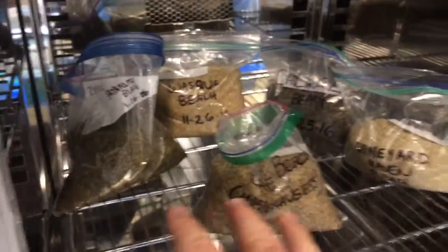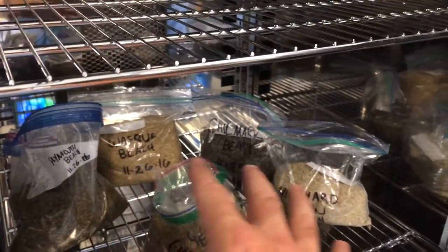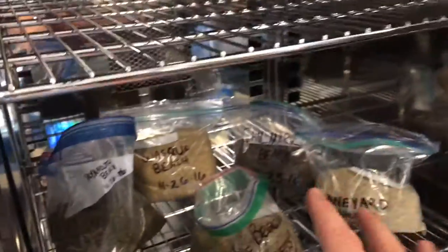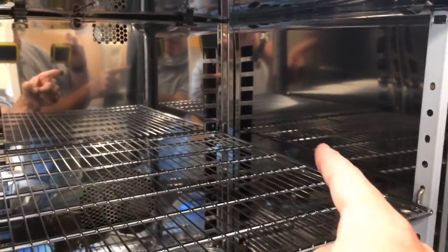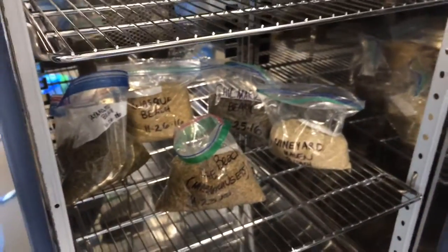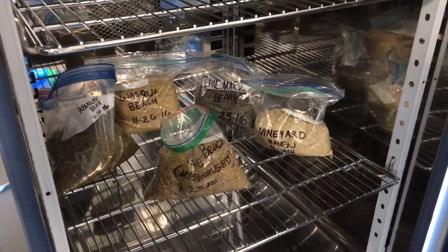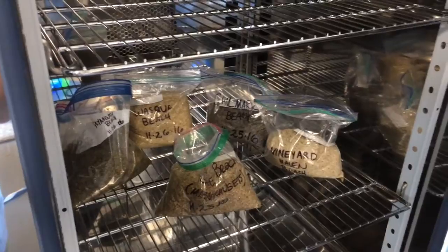So if we have this thing super jam-packed, especially with plastic or metal containers — things that are impervious — we'll tend to get super hot down here in the bottom of the drying oven, and not very hot over here. That will tend to make the sensors think that the ambient humidity and ambient temperature is different than it is, and that tends to cause dangerous situations and leads to inefficient drying.